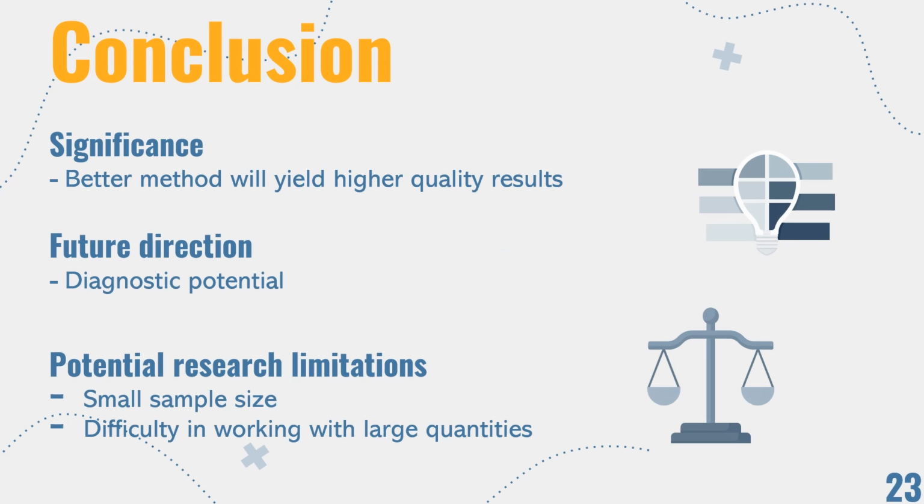In conclusion, the results of this project can be used to create a better method so that it may yield higher quality results. The future potential of saliva is great given that it's easily and painlessly reproducible, therefore giving it great clinical prospect. Finally, potential research limitations include the slightly small sample size and the difficulty that comes with working on larger volumes of samples.